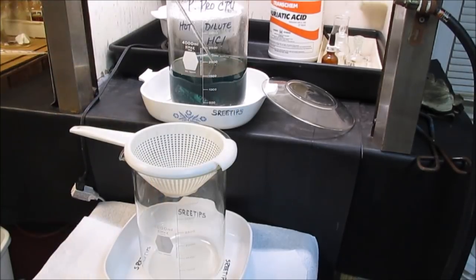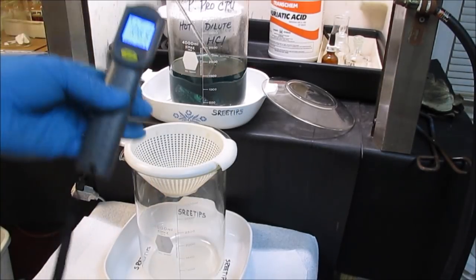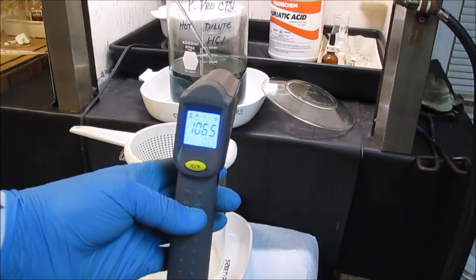The solution has been allowed to cool now for about a half an hour. That's at 106.5 degrees.